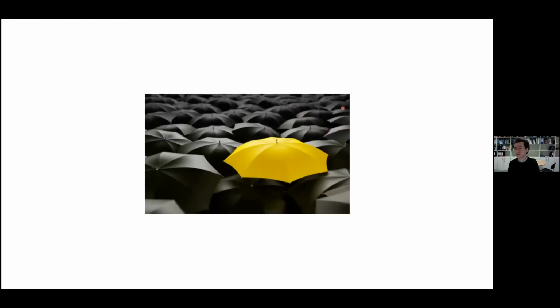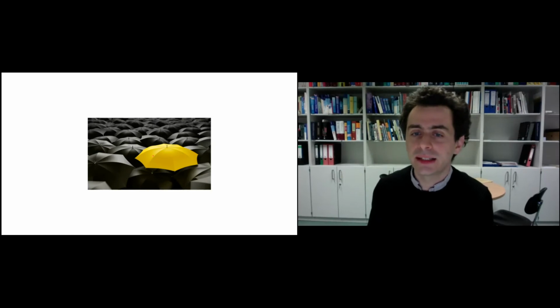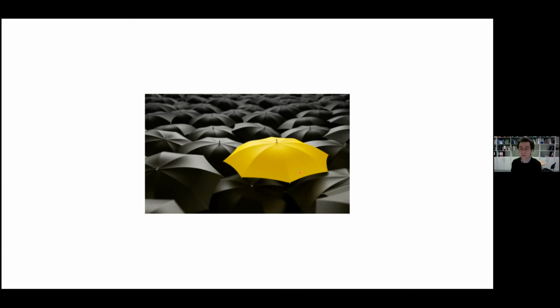There are solutions. So one solution would be to make individual molecules stand out. Because if a single molecule stands out, you know that basically is a circular or a spherical emitter. So you could say, well, I now see this molecule, which is different from the background. So would anybody have an idea of what would be a practical way to achieve this, making molecules stand out compared to the other molecules present in the sample?